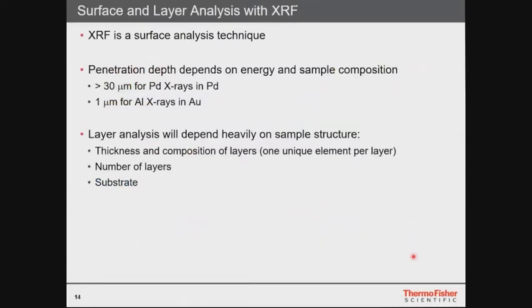And this technique can be used for surface and layer analysis. It is a surface analysis technique, so the penetration depth really depends on the energy and the sample composition. For example, it's 30 micrometers for palladium X-rays in palladium, but only 1 micrometer for aluminum X-rays in gold, for example.